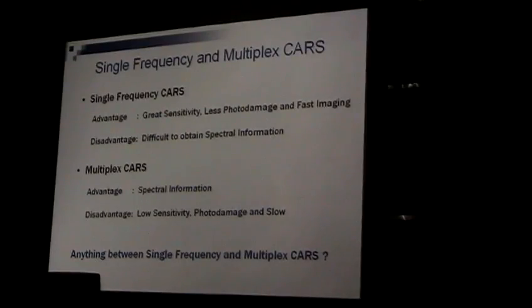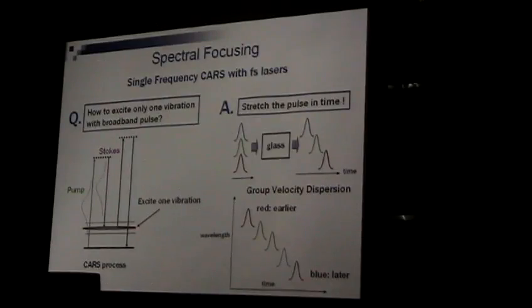become your problem. So actually, I basically stopped about one year ago, and I was thinking, it looks like both are almost at the end. Is there something in between? That's what I was wondering, and I actually realized somebody will try this. So the idea is this: is there any way to do single frequency CARS with femtosecond lasers?